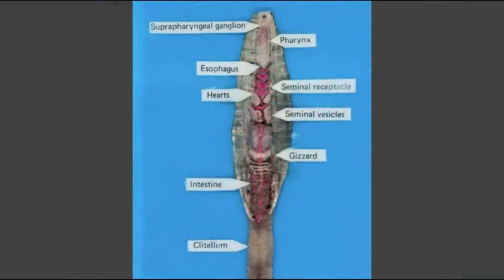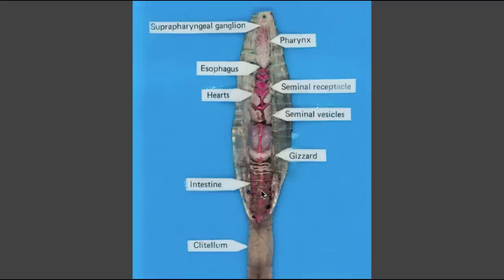Now let's look at a prepared earthworm dissection, several of which are available in the laboratory. At the top, these two small white structures are the suprapharyngeal ganglia — note the label pointer is a bit out of place. These red structures are the hearts. The small white structures on the right are the seminal receptacles, and these larger, somewhat darker structures are the seminal vesicles. The pharynx is clearly visible, but the esophagus is mostly obscured by the hearts and reproductive organs. The gizzard and intestine are labeled, but the crop was left out — let's remedy that.